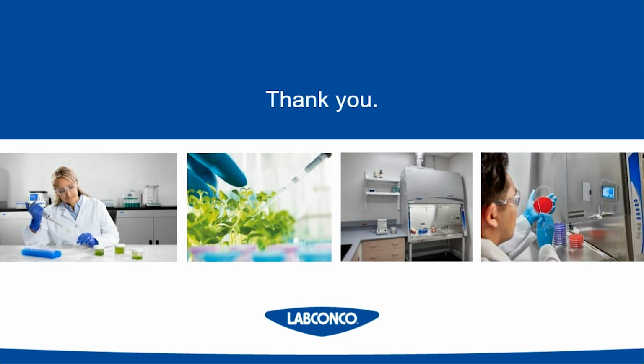Sometimes it's not about how long the cabinet is going to last, but how the safety rules and regulations change over that time. We had a question earlier about the A/B3 style cabinet, and those just aren't made anymore because they just couldn't keep up with today's safety standards. We've found better ways to exhaust cabinets.